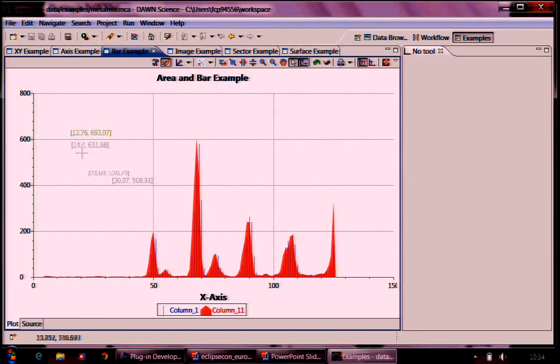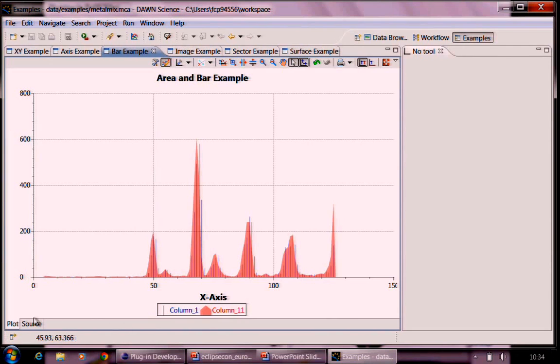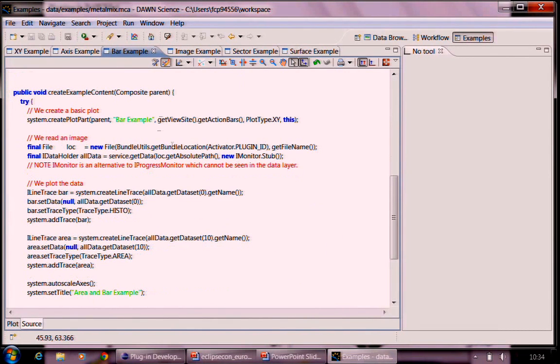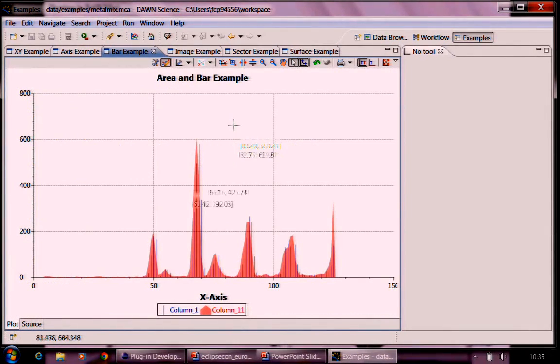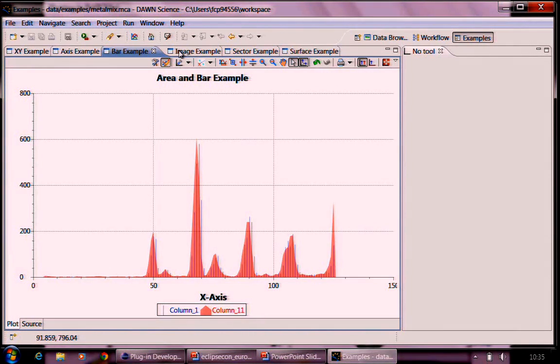And this is all out of the Nebula XY graph project in the underlying layer. But when you program this, you don't need to interact with Draw2D or Nebula or anything. You're just interacting with the data and a plotting system and saying, plot me something. I don't know how you're going to do that. And the idea is to then swap implementations. So we might well swap this for JavaFX. In fact, we've got a project to do that at the moment.